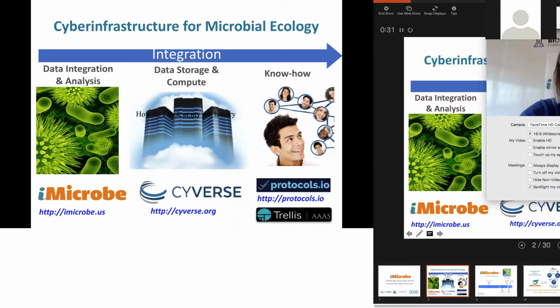In addition to that, the know-how about how to use all of these resources, we've been developing through different protocols on protocols.io, and we're also really heavily involved in the Trellis forum, where we have active discussions about different aspects of microbial ecology, all the way from tool development to the science behind it.